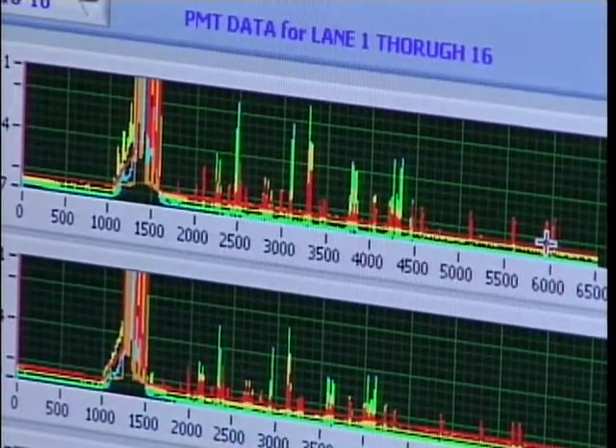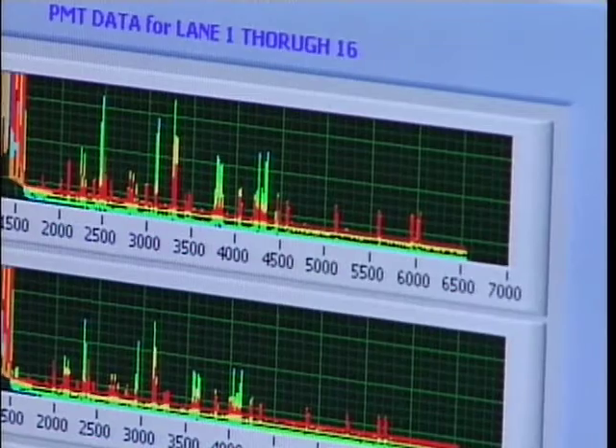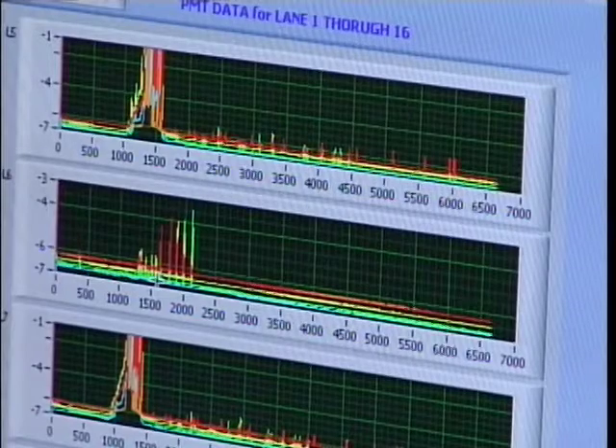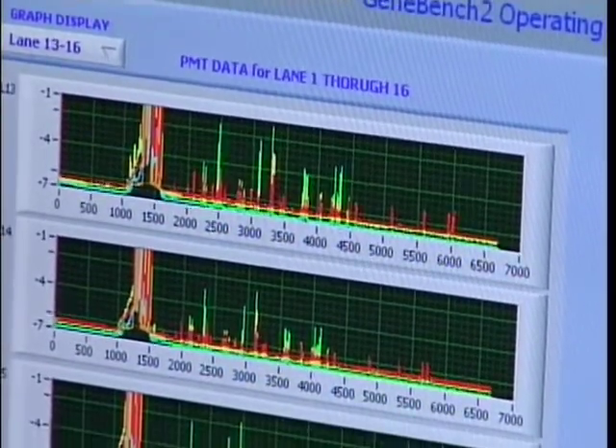We are at the conclusion of the run. As you can see from the run plots, the GS500 sizing standards — including the 490 and 500 base pair peaks — have appeared. The alleles have all appeared, and the allelic ladder loaded in lane 16 is also present. Scrolling through the other lanes confirms size standards and the matrix standard on lane 6 have concluded. The run will now stop.